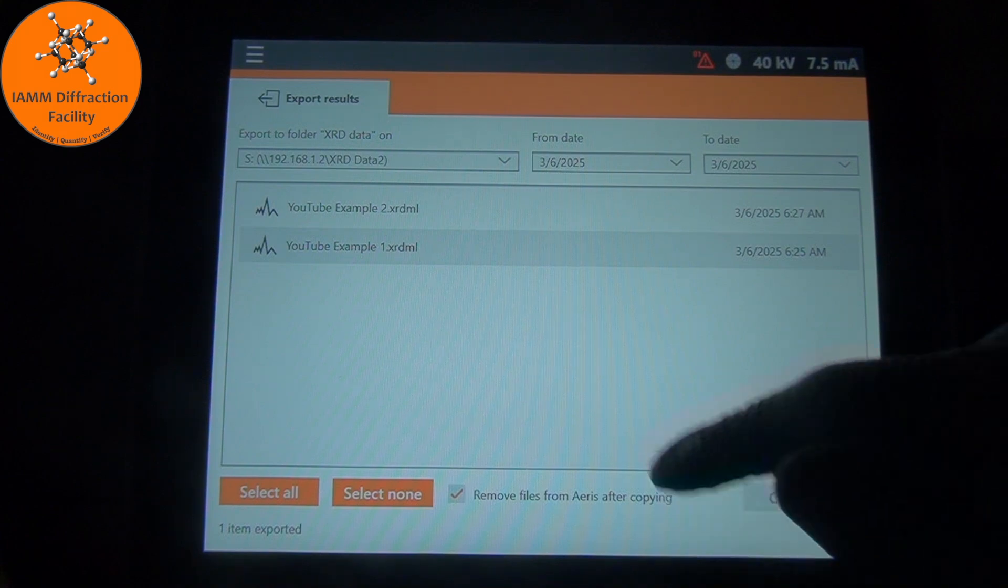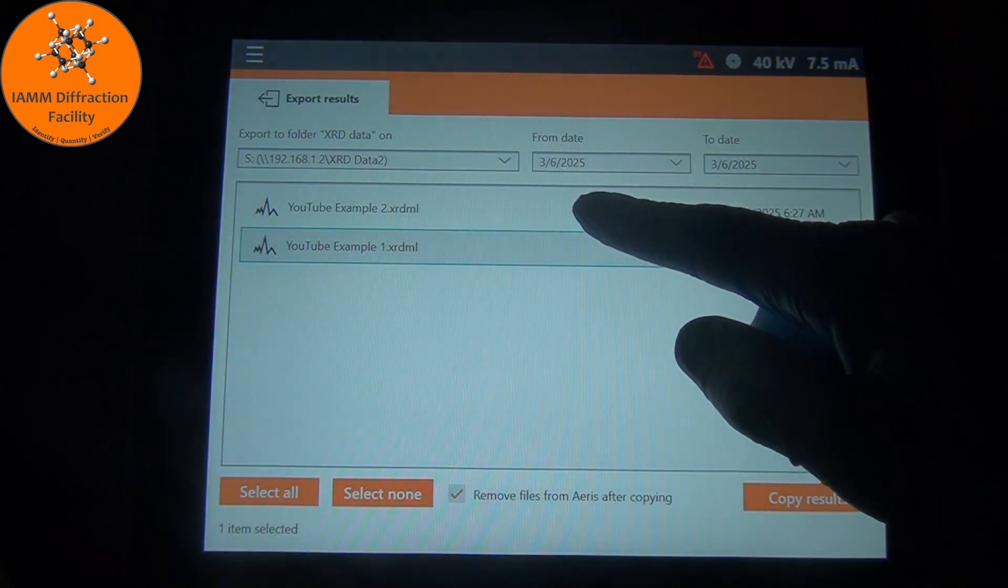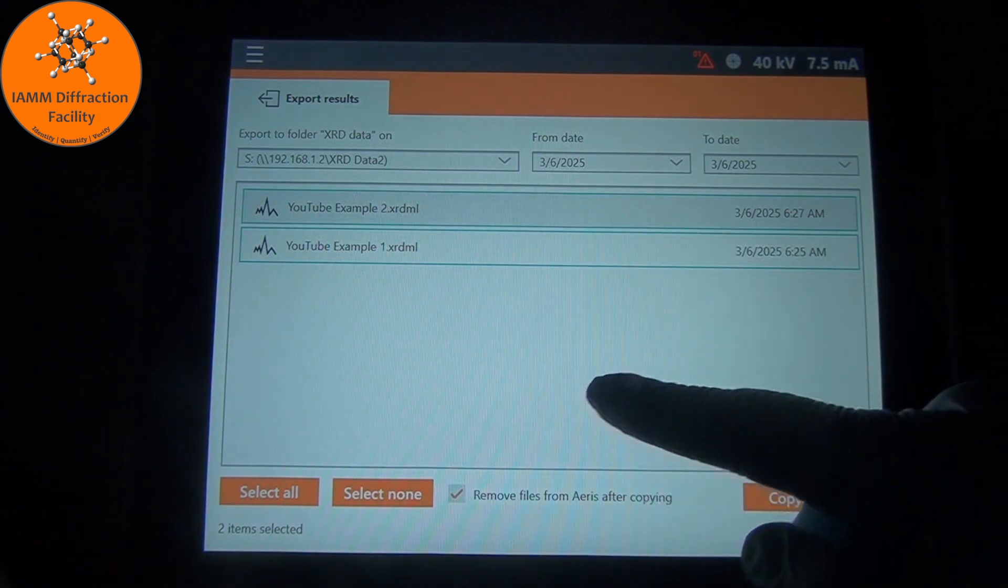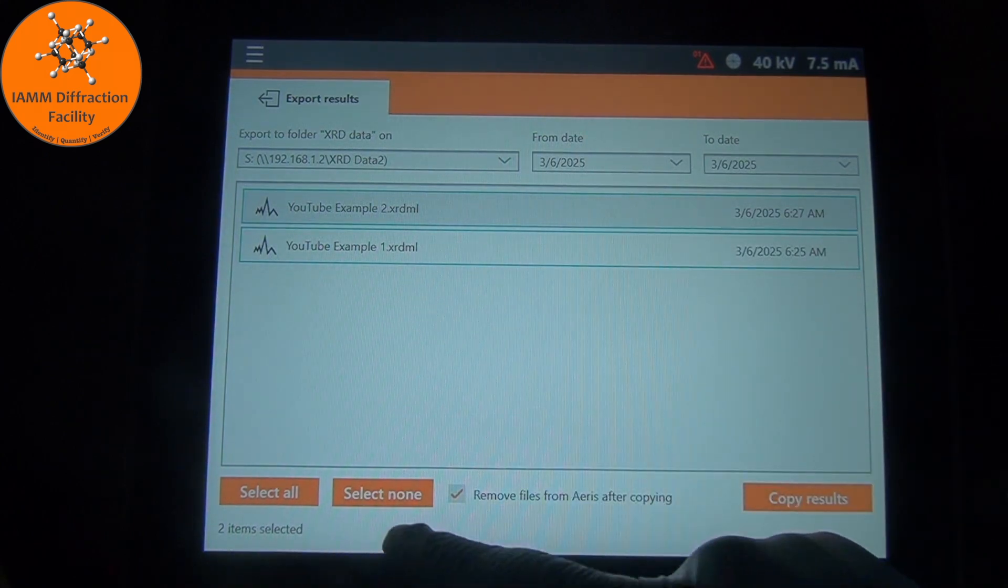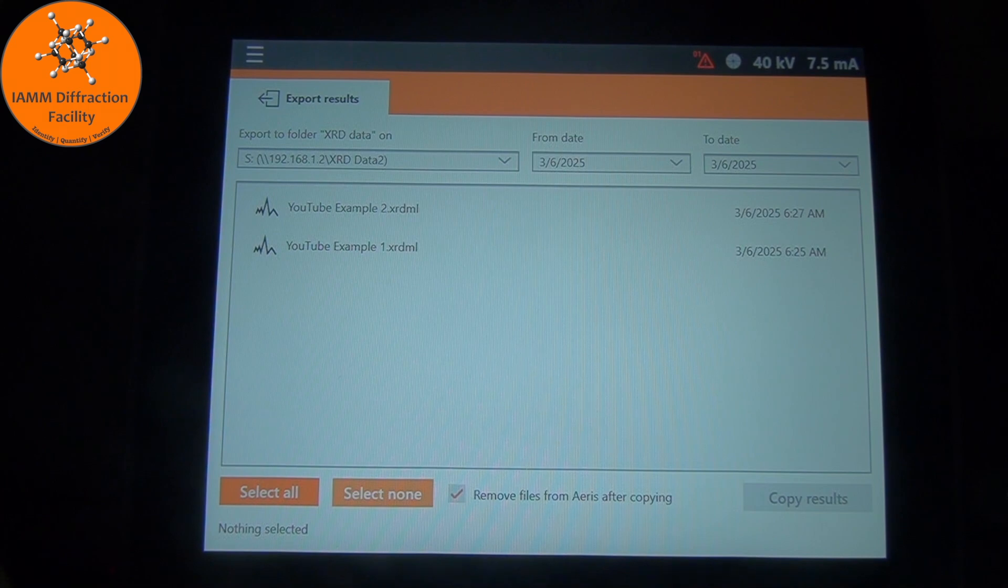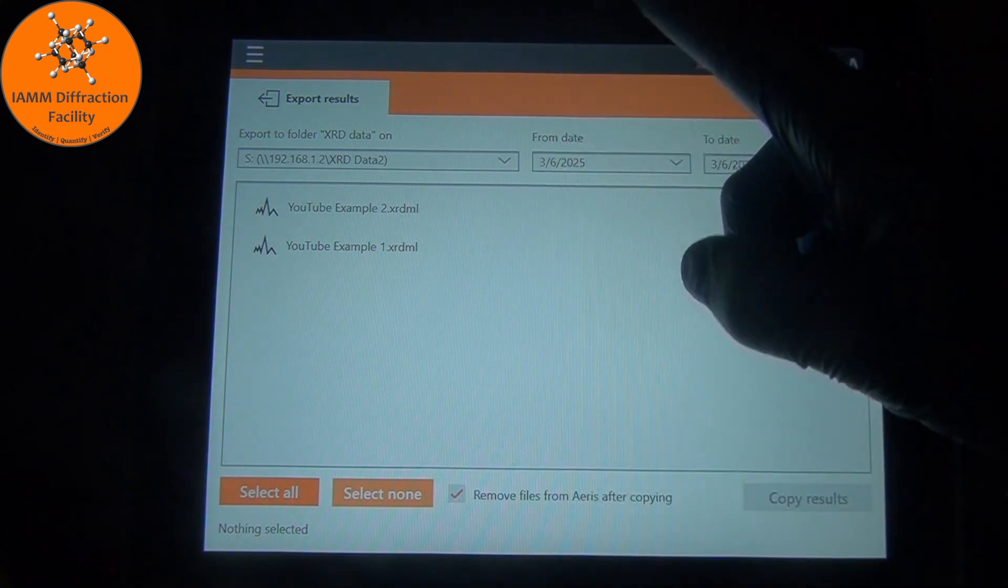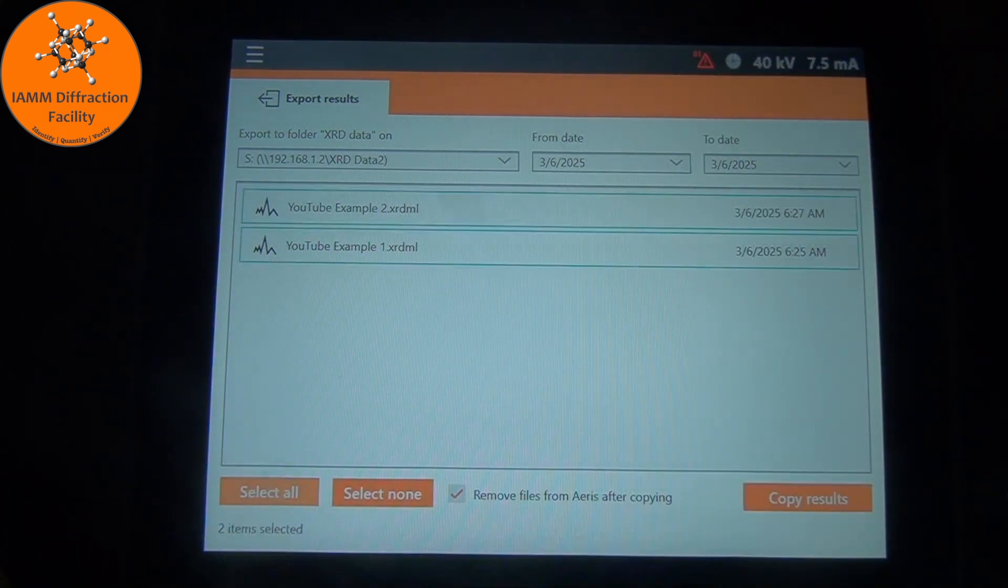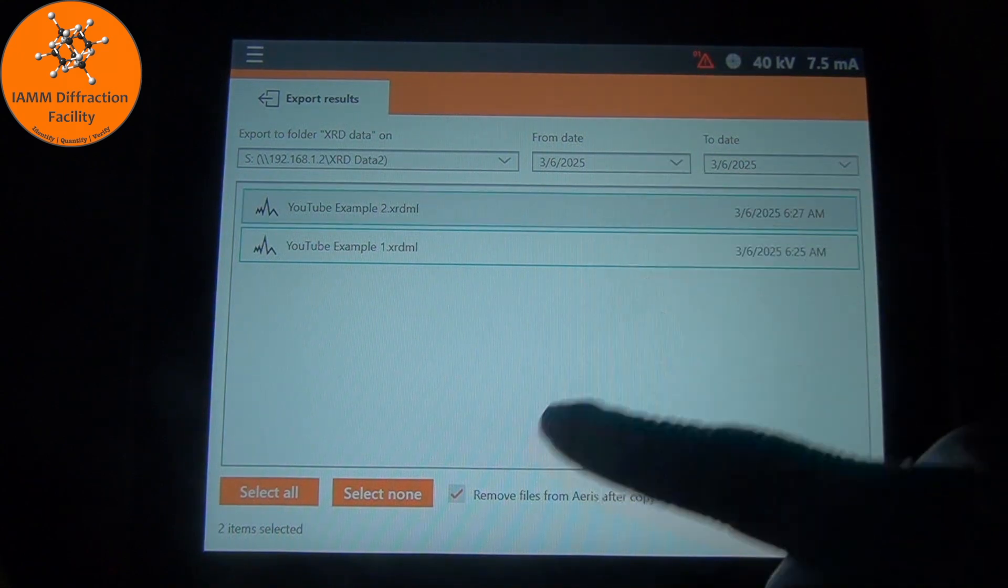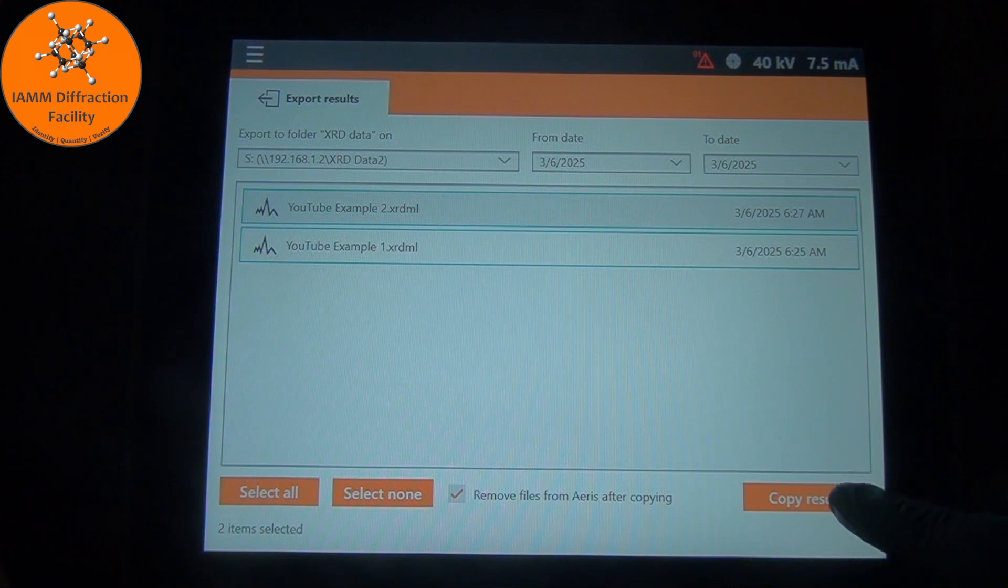At this point, you can click individual files. We see here two items are selected. We could say none. If we wanted to take all of them, we can select all. It highlights all of them. And then it says two items selected.